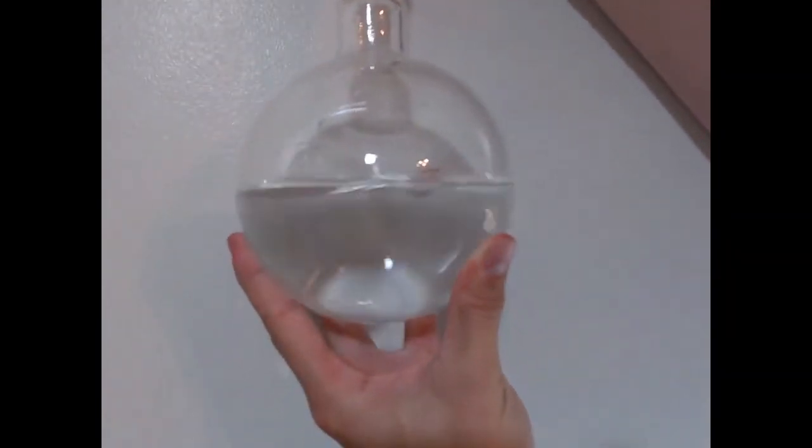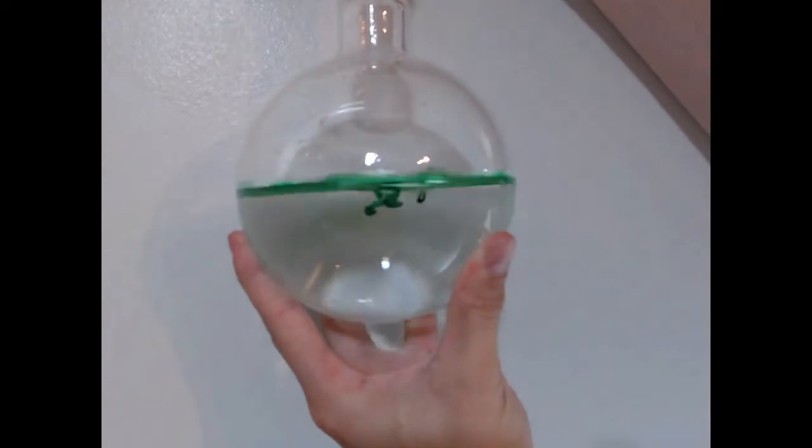To demonstrate how this works, I've filled the round bottom flask with approximately 500 milliliters of water. To the water, I add a few drops of green food coloring.